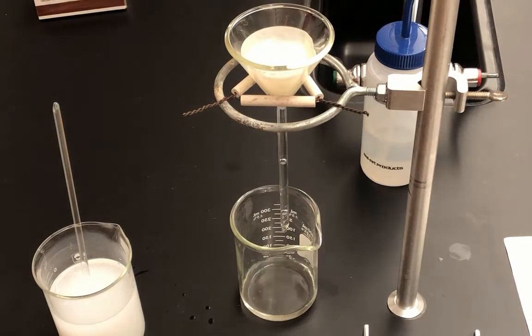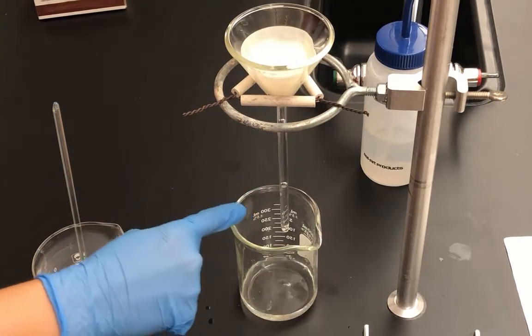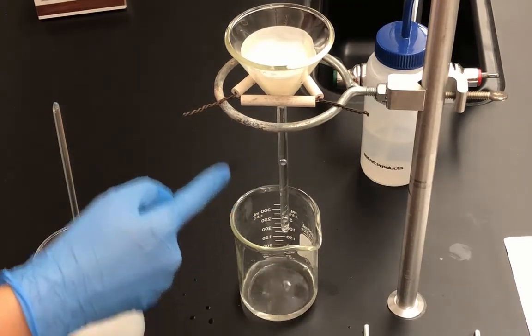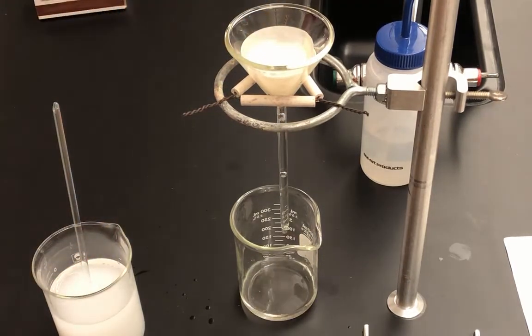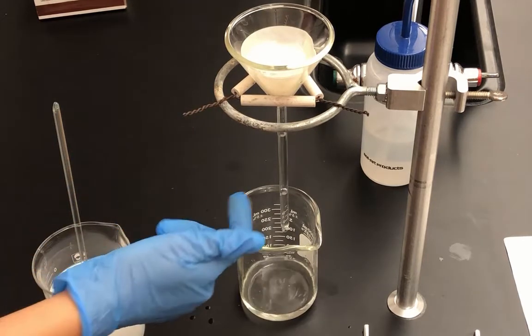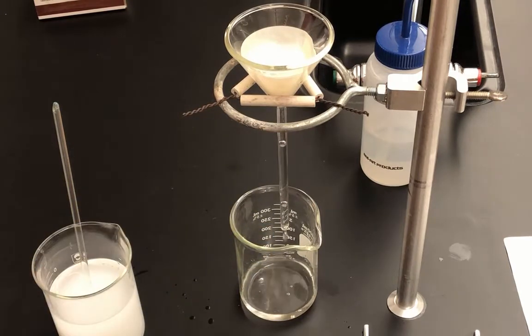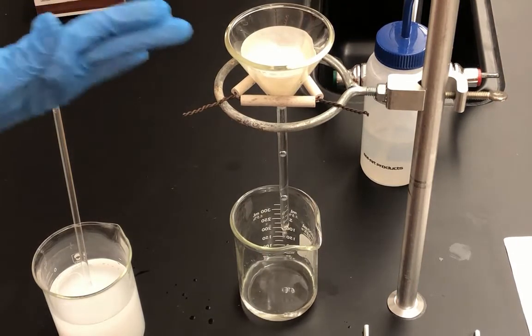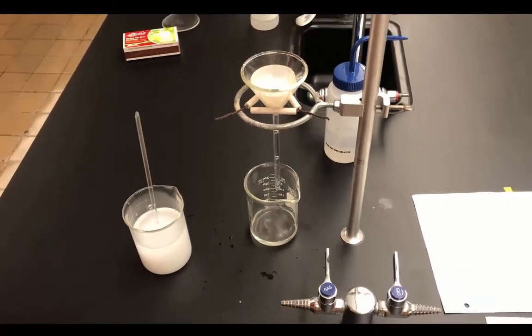Something else I want you to make an observation of is what you notice in the stem of the funnel. Now these are air bubbles, which means that I did not have this piece of filter paper completely sealed against the funnel. And that causes these air bubbles in the stem of the funnel. That's something we want to keep an eye on, because if we notice that the filtrate starts to get cloudy, that means that some of the solid went through the funnel and I'll have to filter it again.